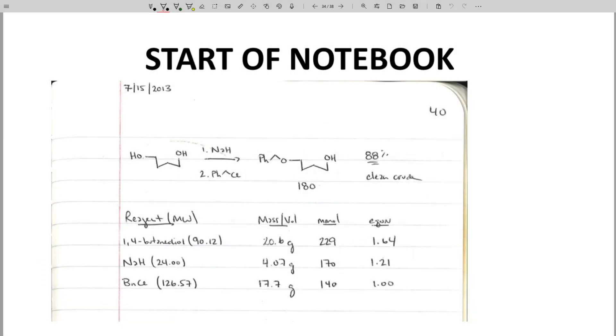Here is the top of the first page from one of my lab notebook procedures. Here are some features. You need a date somewhere. The first page is numbered. In fact, all your pages should be numbered before you start writing in your notebook. Numbering pages is important and allows reference to the experiment based on its page number. Some people emphasize other features, like a title or statement of purpose. I'm not so keen on those ideas.